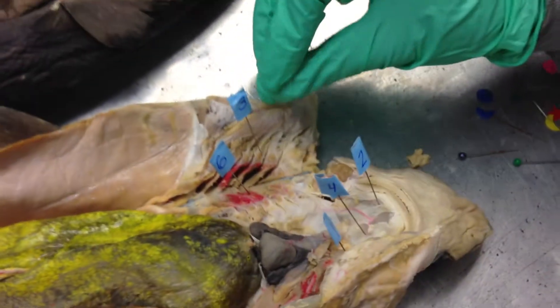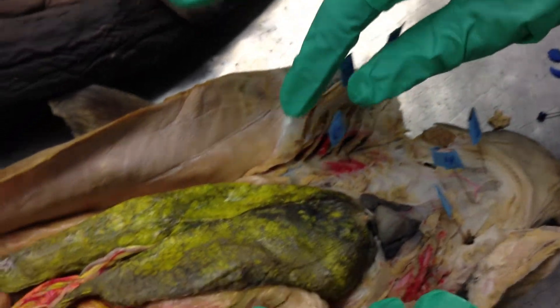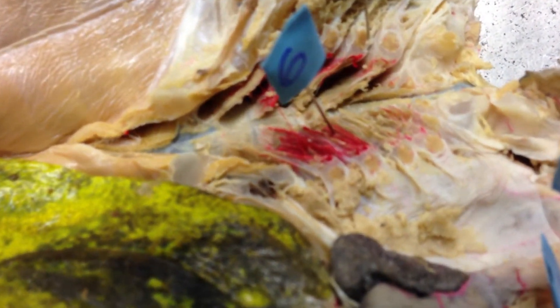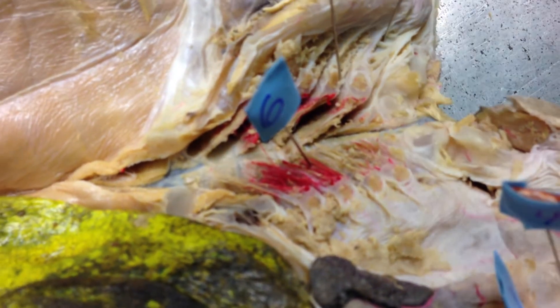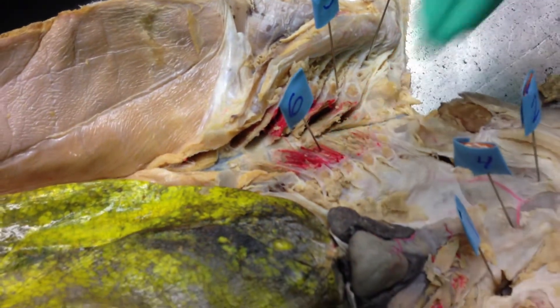And then the primary lamellae is this feathery looking stuff right here where number six is. The lab says there's a secondary lamellae but it says that it's hard to see and you have to dissect the gills further, so I don't think he would pin that. So this is just the lamellae here.